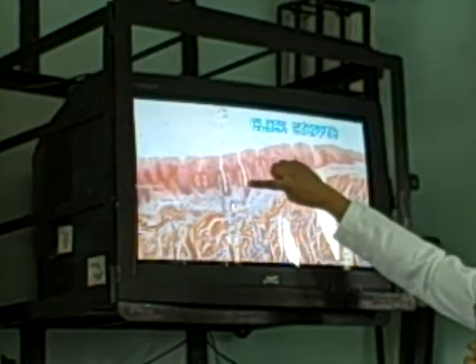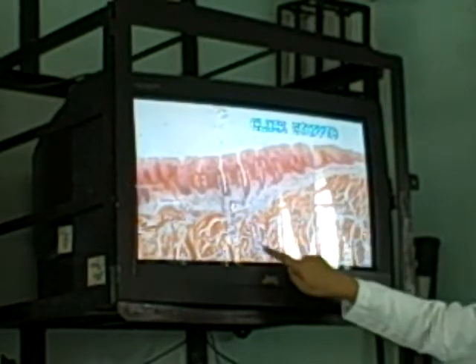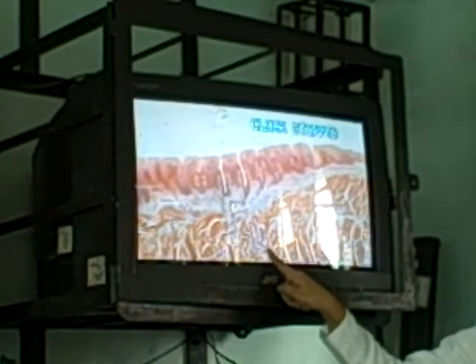This one is not a good one because it doesn't have any taste bud, but I hope you just remember the rabbit tongue. This one, wherein you have your taste buds on the papilla. Remember the papilla? Remember the taste buds? The light stain structures at the sides of the papilla, those are your taste buds. Okay? And below that, you have here your lingual glands.